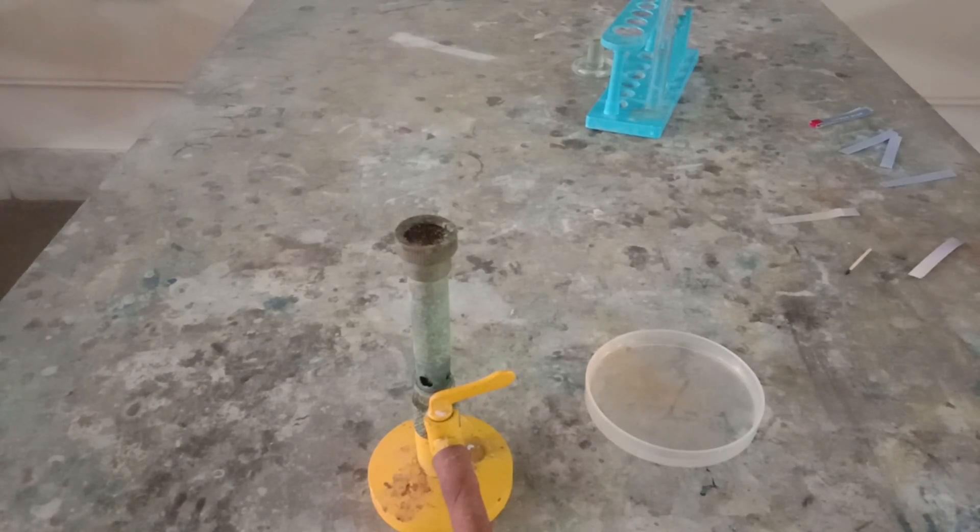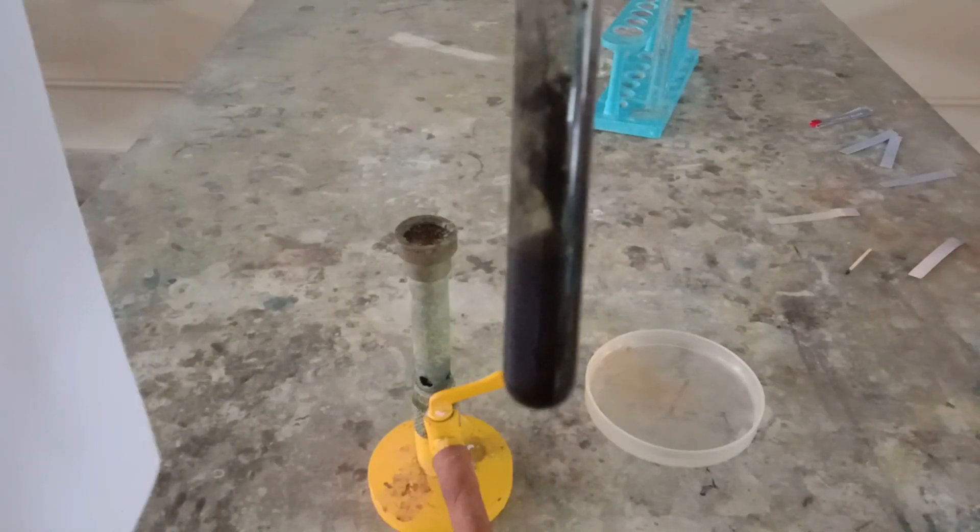I'm going to place this test tube in front of a white background, an A4 size paper, so you can see a very light yellowish color gas present inside the test tube. This gas is chlorine gas.